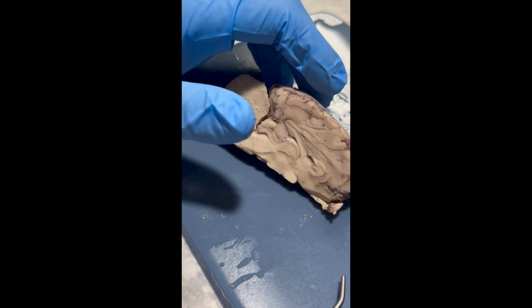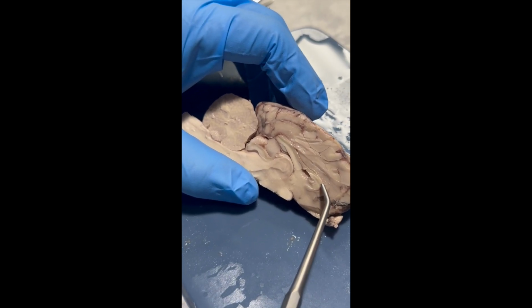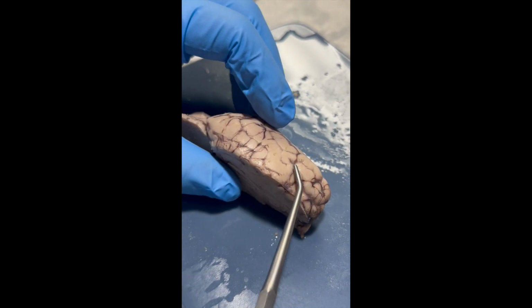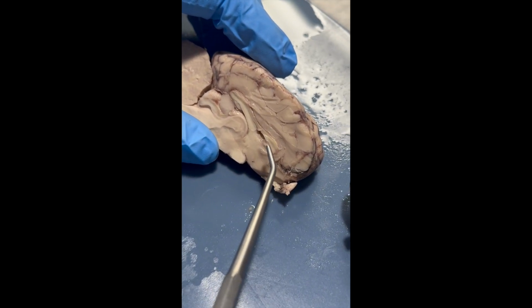So now moving from there, we are going to look at this structure right here called the corpus callosum. It is a band of nervous tissue that connects both hemispheres of the brain. So again, this is one hemisphere, there's another one on the other side. This corpus callosum connects the two and allows them to communicate with each other.